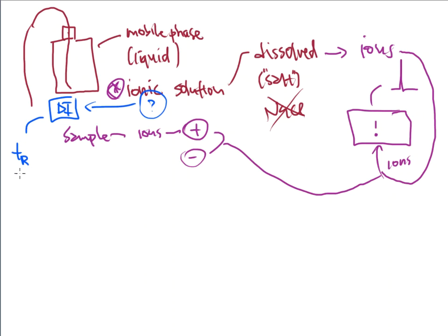So, for instance, the fluoride and the chloride. It was very difficult to separate these two because they both have a -1. And we need these to be perfectly separated. We need a peak for each and every one of them. And DI is going to be very difficult to accomplish that. So we use a little bit of ionic solution, a little bit of things that carry some charges with it, and that promotes the separation for us a little bit better.